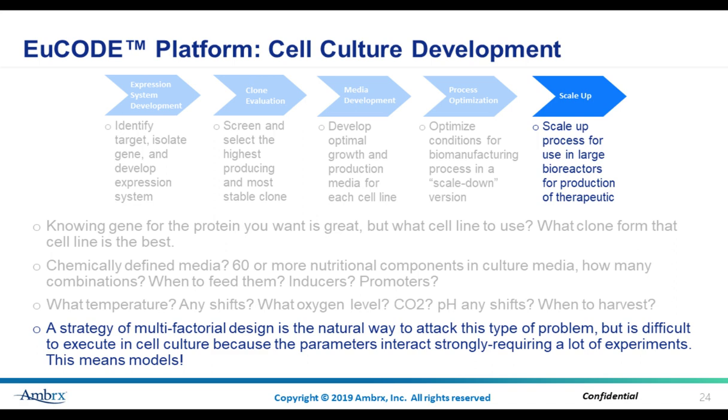In small-scale bioreactors, the operating parameters are typically wider because mixing is generally not a problem even at relatively low agitation speed, and the CO2 removal is efficient due to large surface to volume ratio.